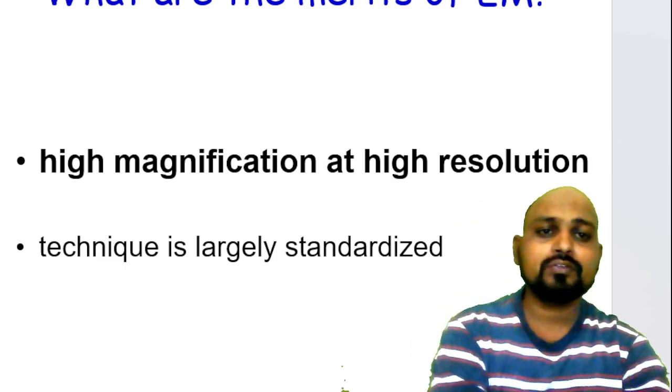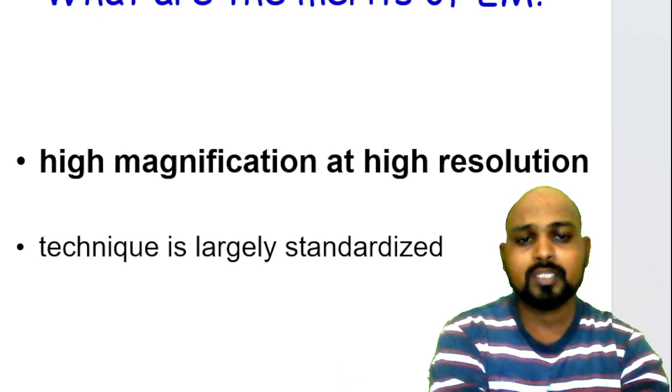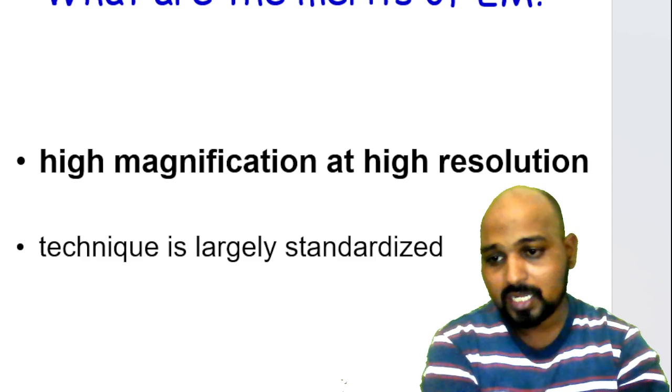What are the merits of the electron microscope? There are two merits given here: high magnification at high resolution, and the technique is largely standardized.